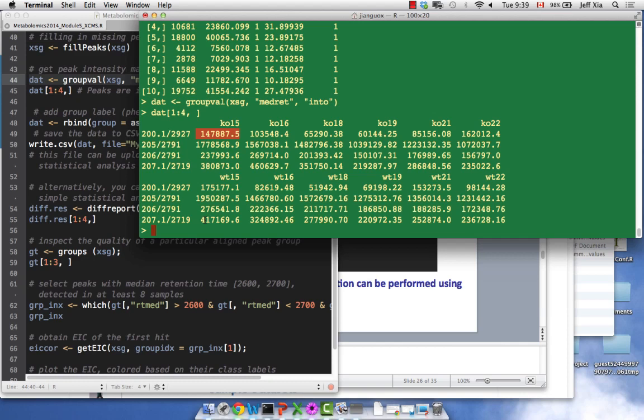Sorry, Jeff. When you talk about the original intensity, is that R going back to the raw spectrum and picking out the original intensity before it's warped to align? Yeah, there's the raw original intensity. There's also peak height. For each peak, people think, what's the representation? You always want the peak to represent the concentration. So there's peak height, original intensity, normalized, and different calculations. It depends on how you perceive the best representation of the concentrations. Okay, so original intensity just means you're choosing not to do any transformations, but you could if you wanted to. Yeah, it already had this information.